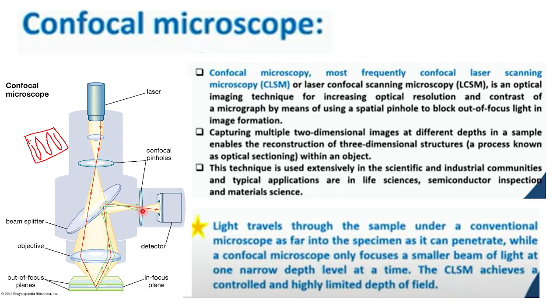If you don't use laser, if you use some other source, for example one generating visible light, of course there is a very wide range of radiation with different wavelengths. So in that case, maybe you need more confocal pinholes. In that way, you can also make it pinpointed.